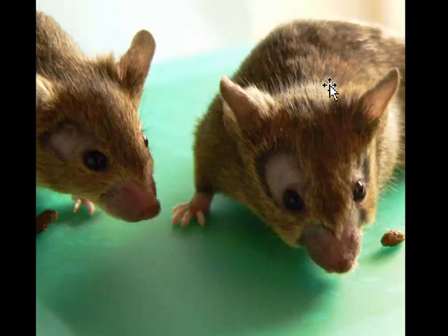If you take a close look at the skin, you could not cut this hair any closer. It is cut absolutely flat with the skin, like somebody took a very, very tiny pair of sharp clippers and clipped those areas. And the distribution here on these two mice is very important because of the importance that mice have for their whiskers and their eyelashes in investigating their environment.